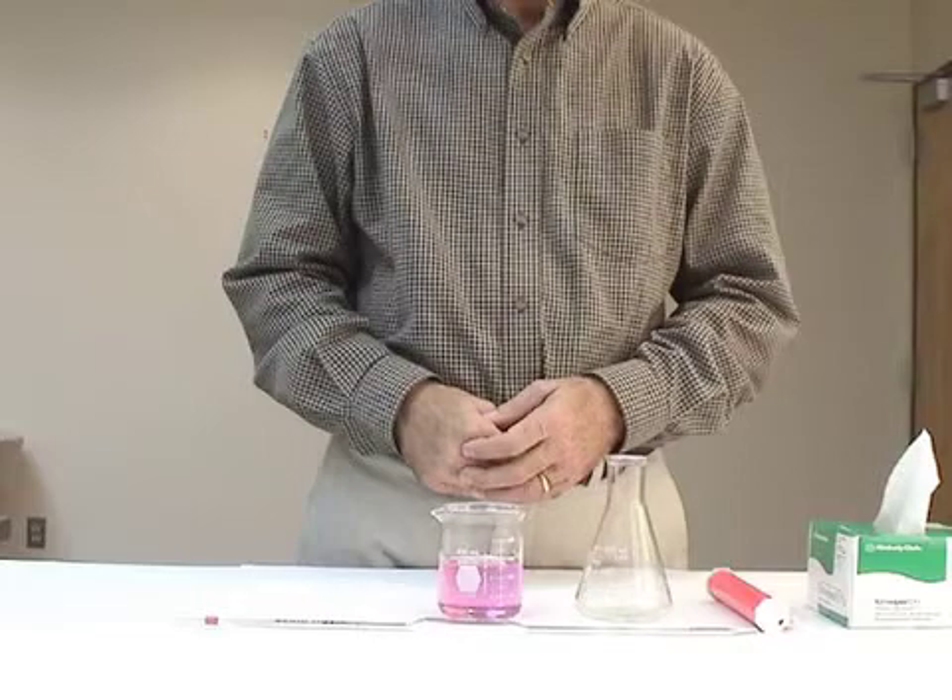You'll need the apparatus shown here: a thoroughly clean pipette, a pipette filler, and some chem wipes to wipe off the pipette and clean up any spills.